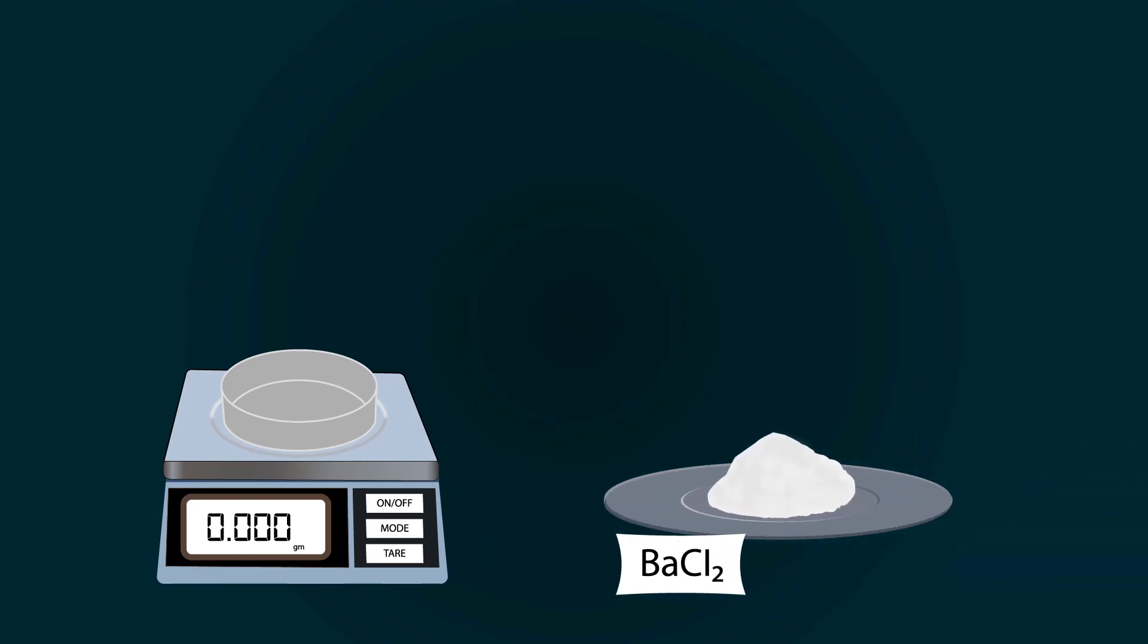Now add barium chloride into the petri dish with the help of a spatula. Weigh precisely up to 10 grams.